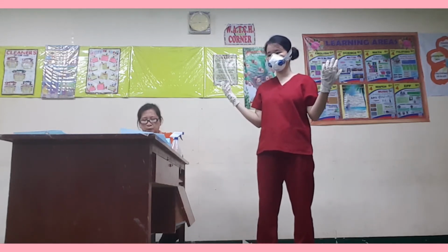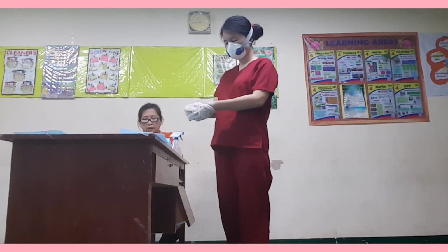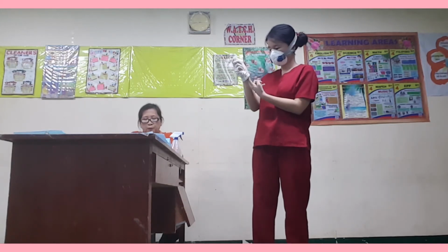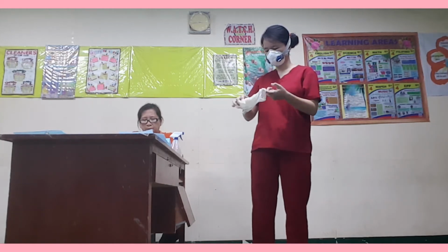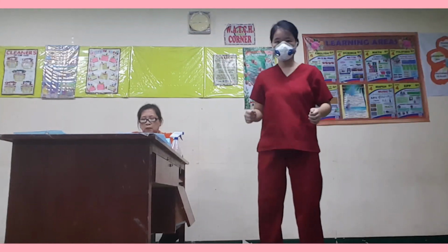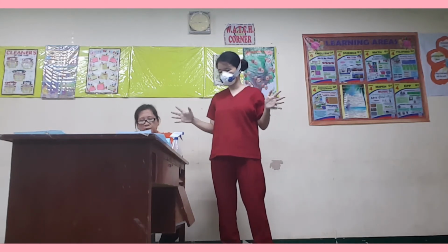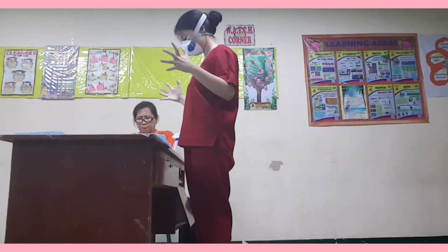Procedure number 16. Change inner gloves. Remove and discard gloves, taking care not to contaminate bare hands. Perform hand hygiene with alcohol-based hand rub (ABHR). Put on a new pair of gloves.